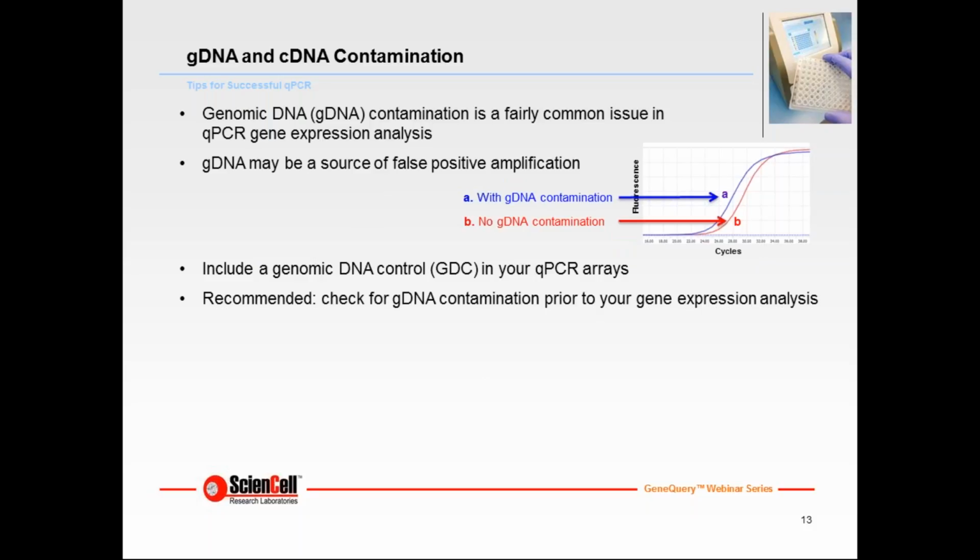Due to the high sensitivity and indiscrimination of the qPCR method, contamination will also be amplified exponentially and interfere with accuracy and precision, especially for genes with a low copy number. There are 2 main sources of contamination: internal contamination from genomic DNA and external contamination of cDNA introduced during sample handling.